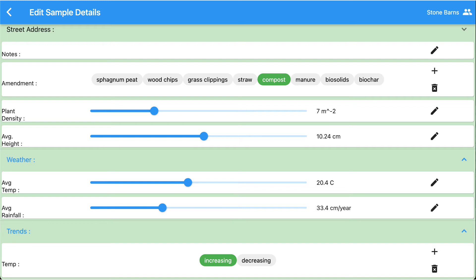Here we are in the edit sample details screen, which is outside of project management settings. Once you've measured a sample and you come to the sample edit screen and it's assigned to our project — which we happen to call stone barns — we've got all the fields that we added, such as plant density, average height, etc. The precision was set for two decimal points for average height, and we can see that reflected here. Plant density was in whole numbers. I've also changed the units to meters to the minus two, because density is per square area and you need the minus in the exponent. I did that in the project management settings, and it shows up here.